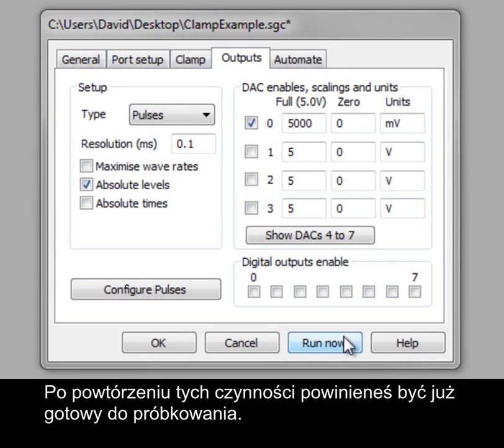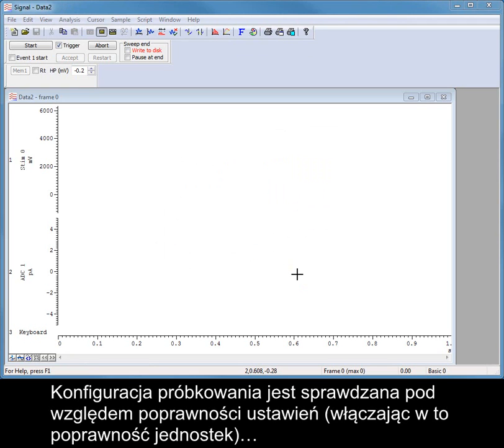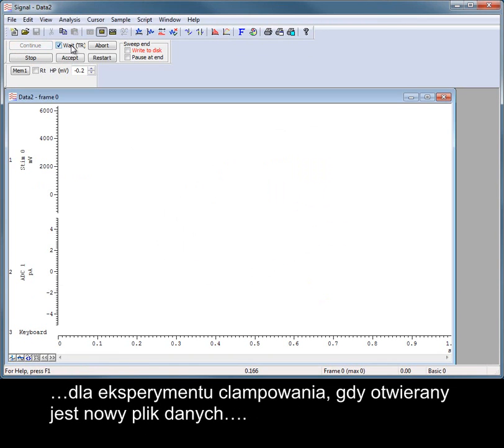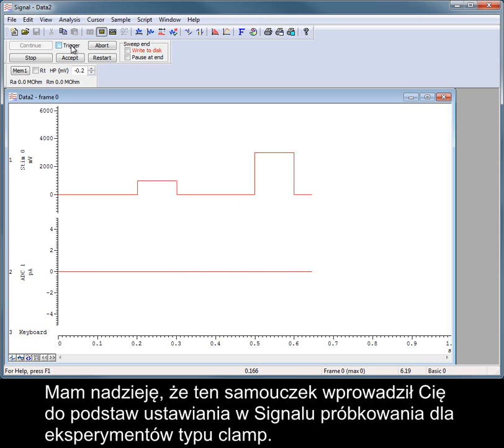Following these steps, you should now be ready to sample. The sampling configuration is checked for the correct settings, including the correct units, for clamp experiments when a new data file is opened, and Signal will generate an error message to alert the user if any incompatibilities are found. I hope this tutorial has given you a basic introduction to setting up clamp sampling in Signal.